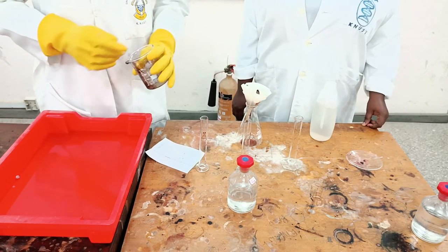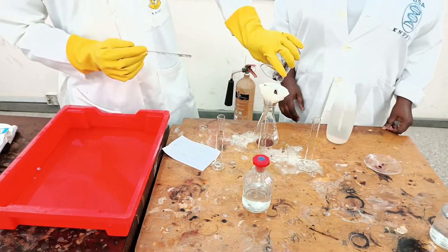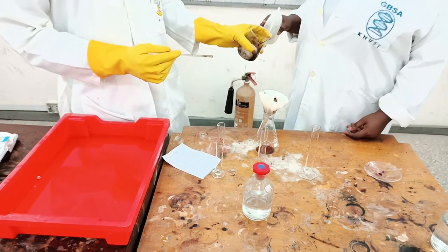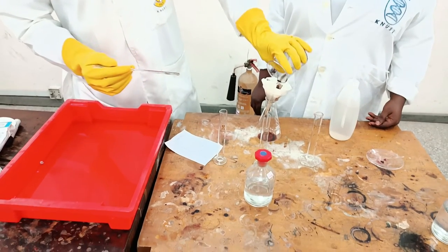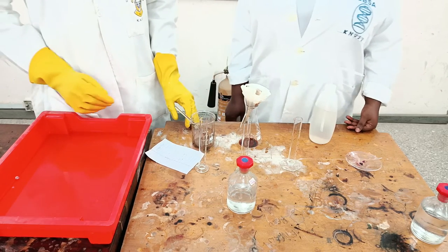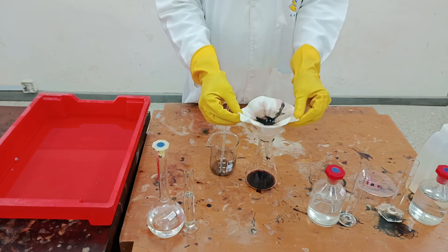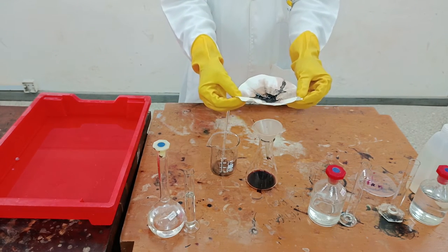Then we rinse it with water. Alright, now the solid here is a mixture of our crystals and charcoal. So we need to do our recrystallization.